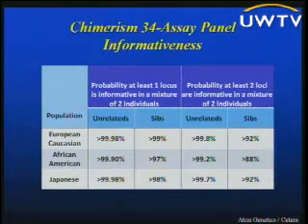In terms of its power of discrimination, it's nowhere close to being as powerful as the STR. Now this is again information I got from the company, where your chances of finding at least one locus that's informative in a mixture of 2 individuals in 3 different populations was looked at, either unrelated or individuals that were SIBs, and then your probability of finding at least 2 loci.